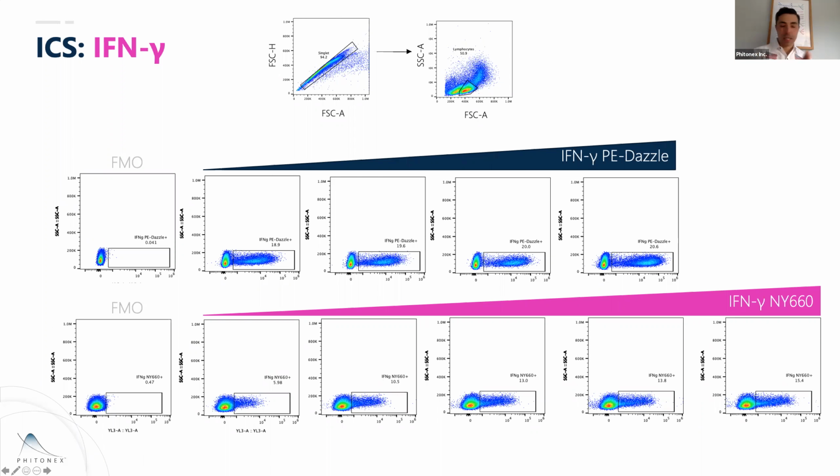Right, and this was the question because of what I showed earlier with the size of these things. They're about 150 kilodaltons, so they're about the same size as an IgG molecule. So while I could hand wave and say, oh well, they're smaller than PE, it'll get in, a lot of questions, right? I mean, it's a DNA structure, so what does the background look like? And so what we do here is we do a higher dose of blocking after we do a permeabilization. But we've tested this in saponin-based fixation, and then the next one is a methanol-based fixation.